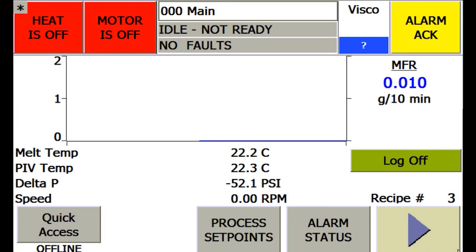This video describes basic operation of Dynisco's PLC-based online systems for Visco sensor, CMR4, and FCR rheometers.